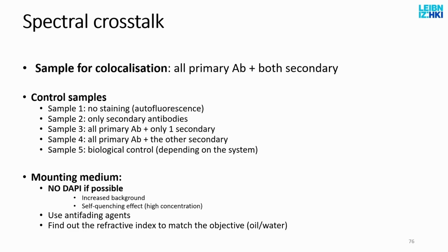There is no error there. But then I go into a very different refractive index, water. So if I now focus deep into the tissue, the deeper I am, the worse I get, and I somehow have to compensate for that. I have a point spread function that widens very, very quickly as I focus deeper.